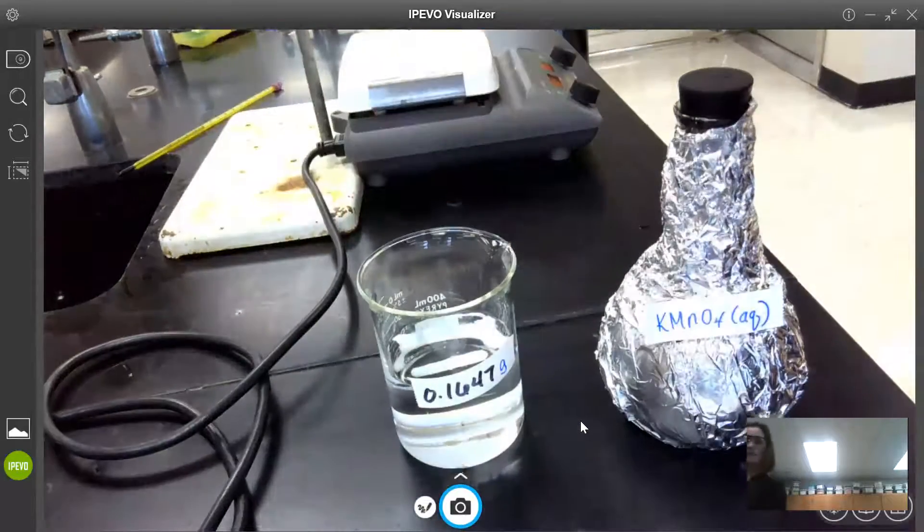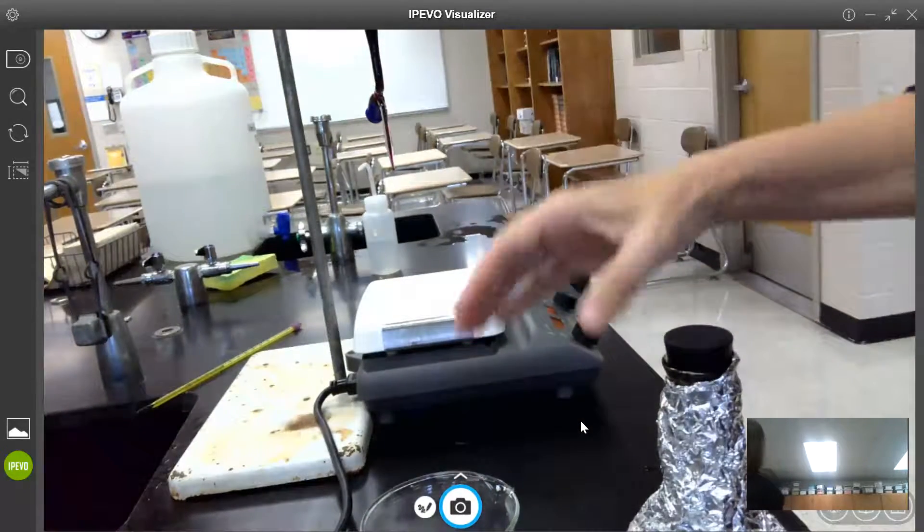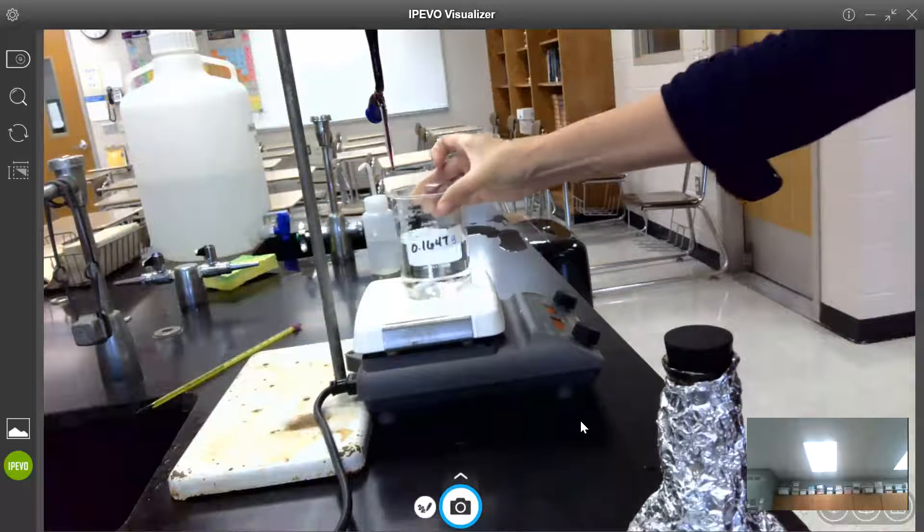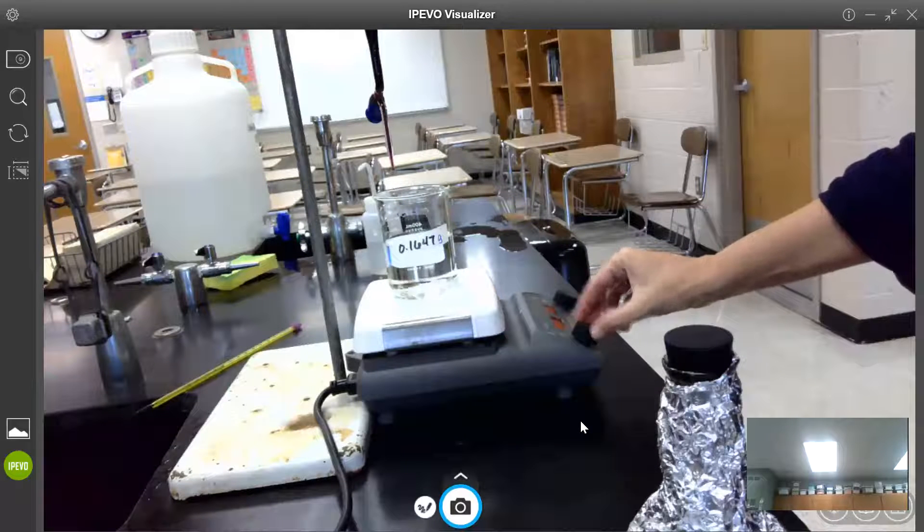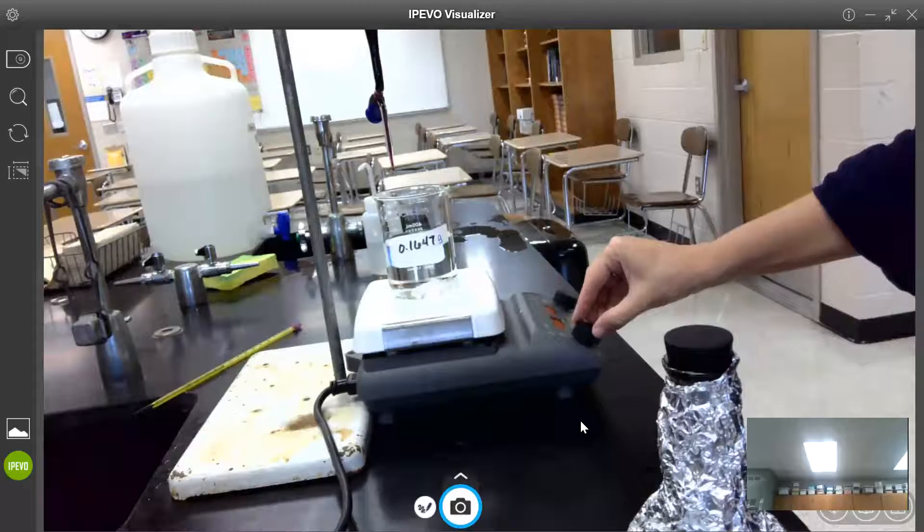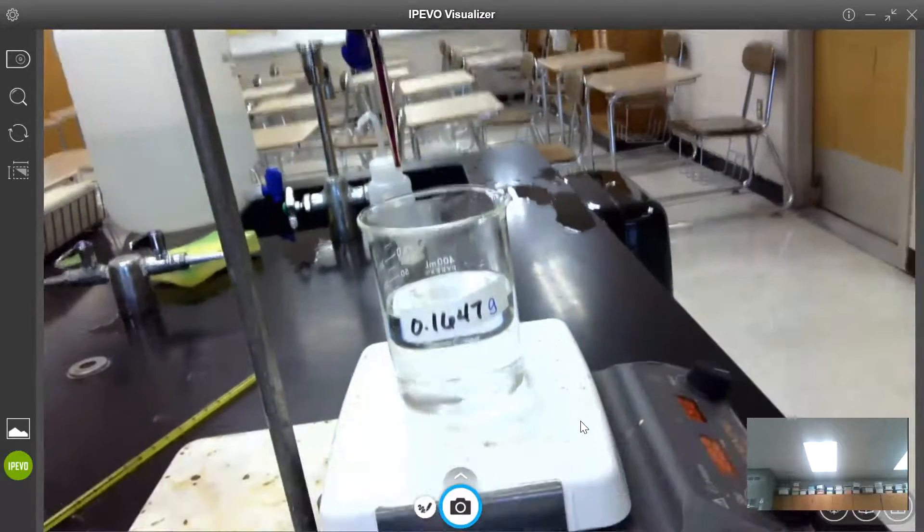So I'm going to take that beaker and place it on our stir plate which is preheating and I'm also going to start stirring it and I'm going to move us a little bit closer here so you can watch what's going on.